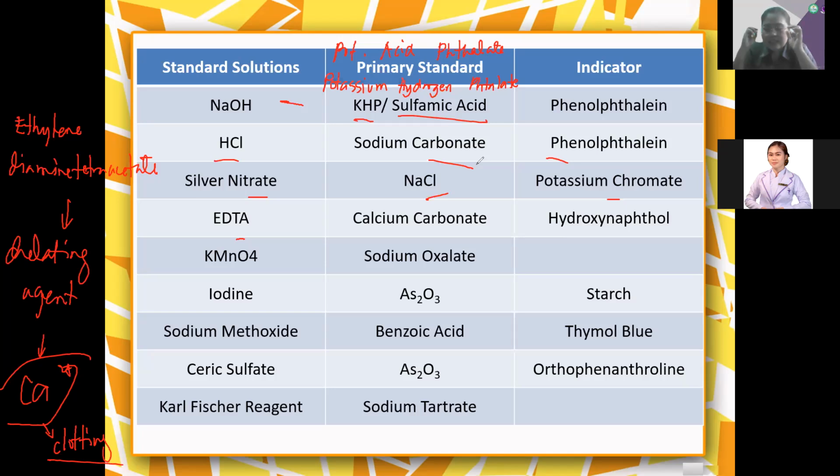Potassium permanganate is a strong oxidizing agent. And we may also do standardization for this using sodium oxalate. And if napansin niyo, wala siyang indicator. Bakit? Kasi potassium permanganate is an indicator itself. Mag-change din siya ng color kapag na-oxidize or na-reduce siya. So hindi mo na need ang indicator dyan. Anyway, we will have a thorough discussion of that when we discuss oxidation and reduction.